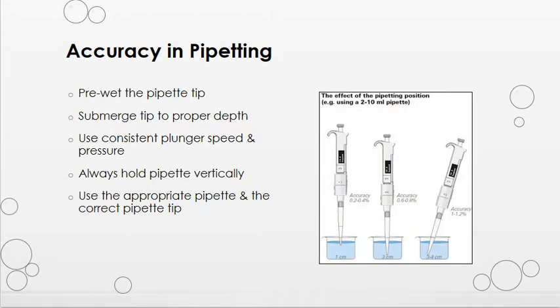It is important to pipette correctly to maintain accuracy. Some pointers to improve pipetting technique include pre-wetting the pipette tip, making sure the tip is submerged to the proper depth in the liquid, using consistent plunger pressure and speed, and always holding the pipette vertically. It is also crucial to use the appropriate pipette and correct pipette tip. In the image here, you can see how accuracy is affected just by the position of the pipette.